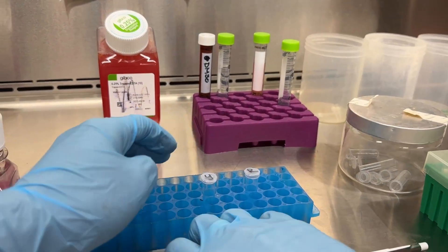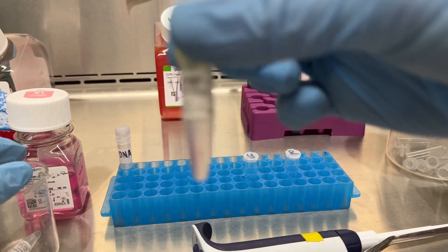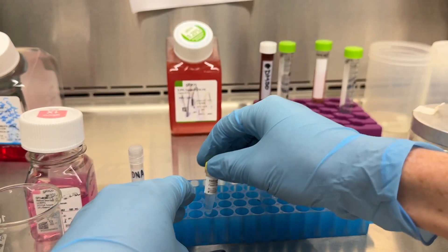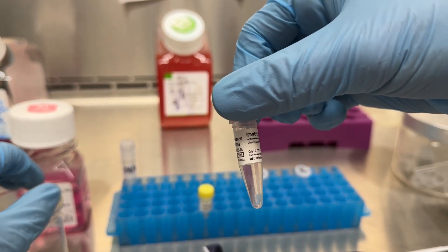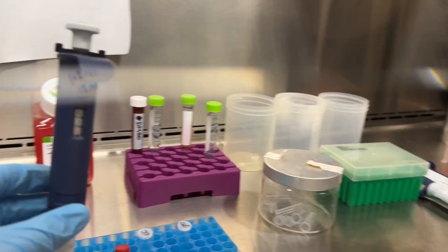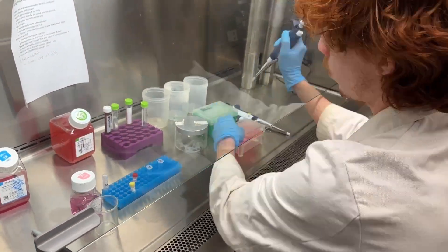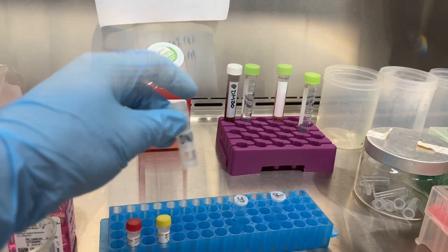Into the R tube he places the lipofectamine. We call them Y and R because the two reagents have a red cap and a yellow cap — though depending on the manufacturer, cap colors may change. When you have multiple transfections, you can't just label everything Y, R, Y, R — you'll have to be a little bit more careful.